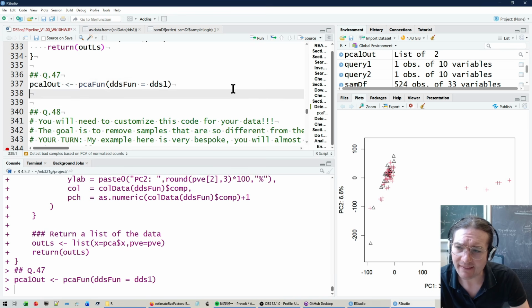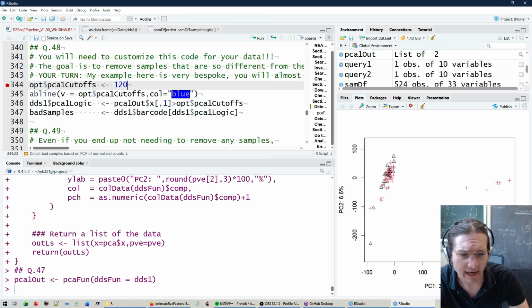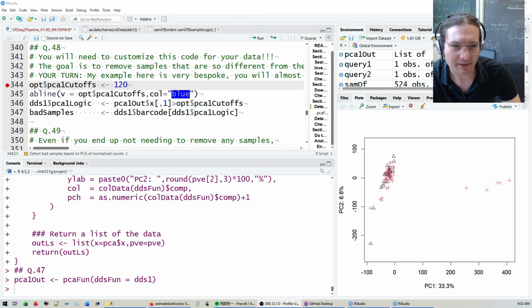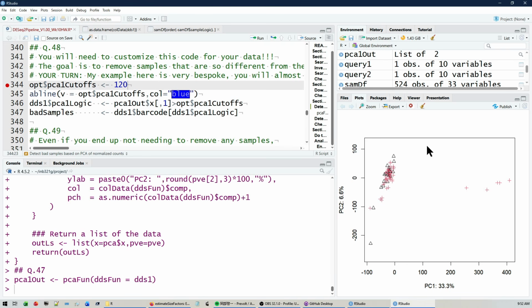So with that, now visualized, I can start to make some decisions. I can say like, all right, I think that, let me move my head again. Sorry, that's probably nauseating. I think that the cutoff, somewhere in this section, will be sufficient to help me isolate those.